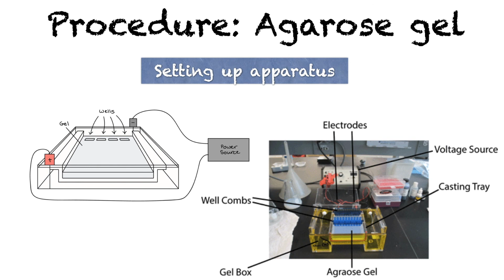It is the nature of DNA and RNA molecules: they move from negative to positive because they are negatively charged. We have to give power accordingly. So towards the wells where we load the samples, we have to give the negative power. And you are seeing here in the picture how we commonly set up the gel in the laboratory.